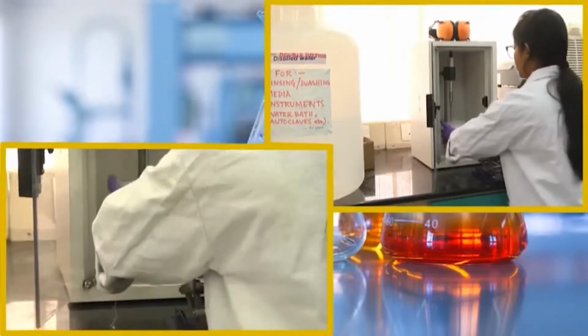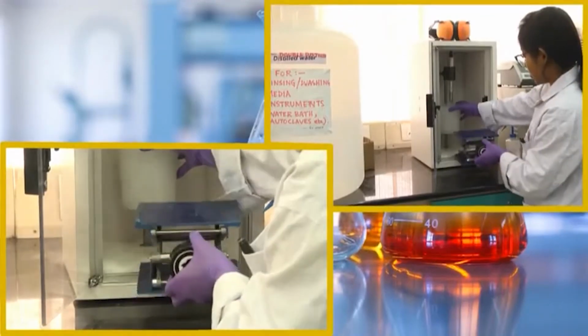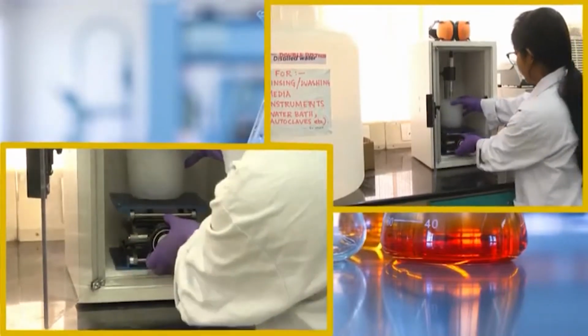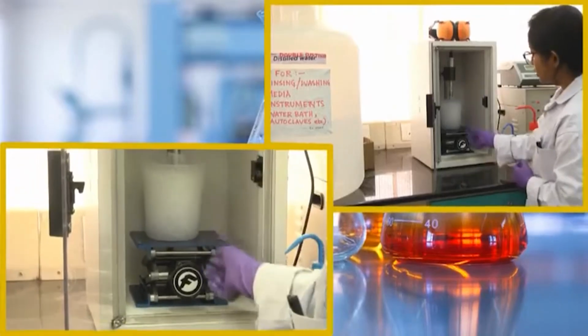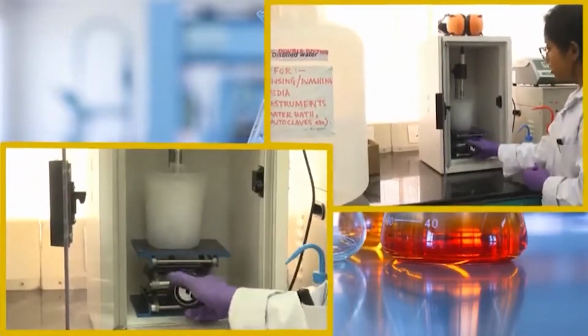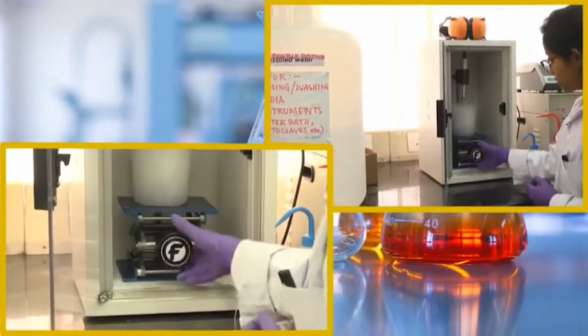So, for that purpose we will put the whole thing here, and we put the platform here. As the sample is at the bottom of this tube, we might need to increase the height of this platform. That we can do using this particular lever.